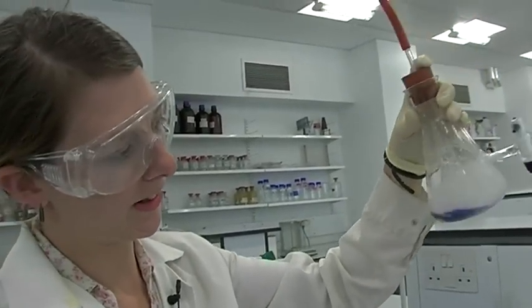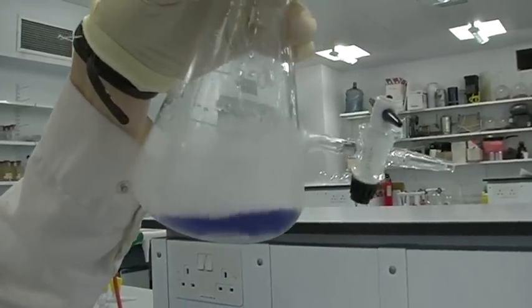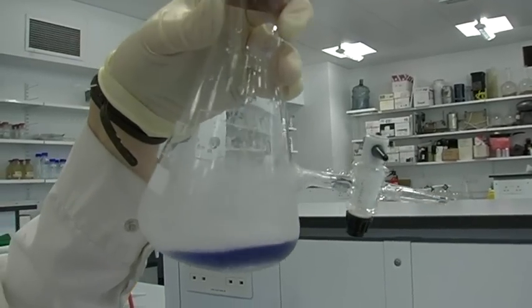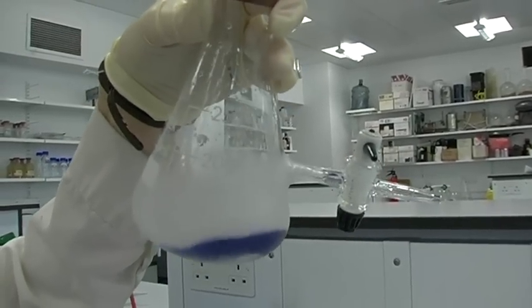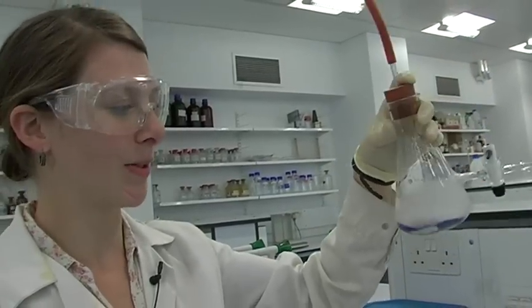There's a lovely purple color, and that's the 2 plus oxidation state of vanadium. So we've seen the 5 plus oxidation state which is yellow, the 4 plus which is blue, the 3 plus which is green, and finally the 2 plus which is purple. All of them are very very distinctive. It was very easy to tell the difference between those different oxidation states just by color. For some metals you can't tell just by color what the oxidation state is.